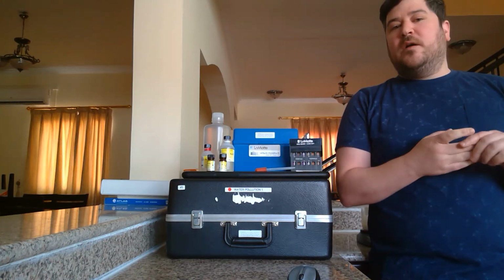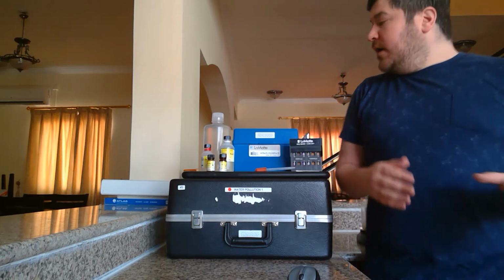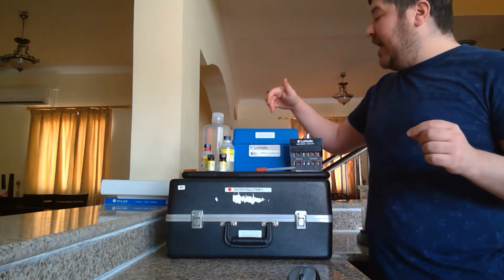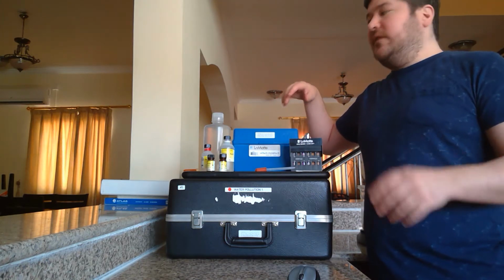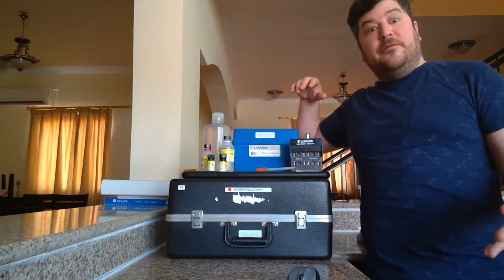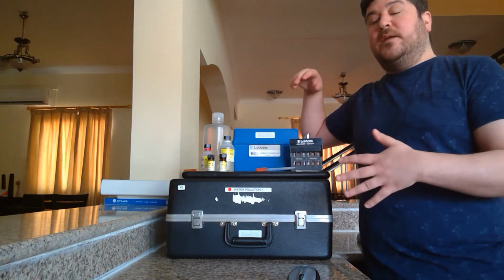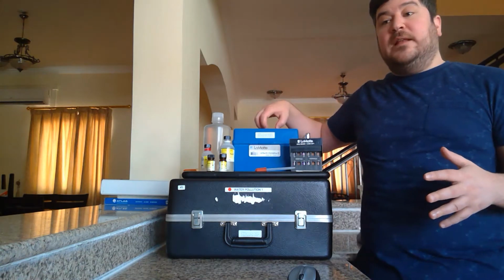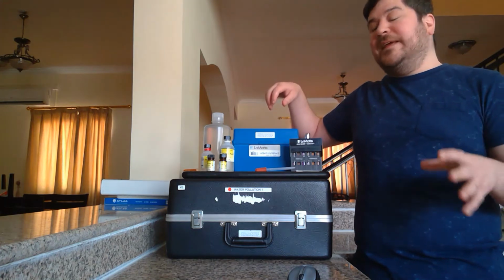Hey everybody, welcome back. Today we're going to do lab number 4. This is another test kit lab where we're going to look at the levels of nitrate and phosphates in a water sample. Now, today I'm going to film 2 labs, one for this week and one for next week. I'm going to do the nitrate and phosphate lab and then the total dissolved solid or salinity lab.